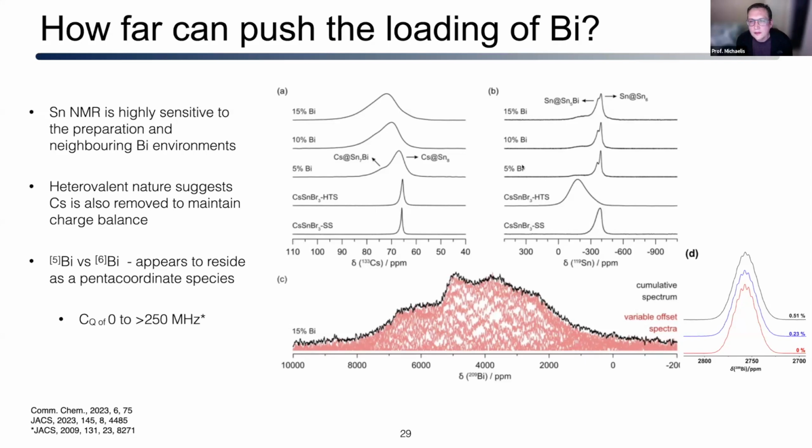Even though you do not see an EPR signal of the sample, you do see a slight shift as compared to the solvent synthesis. Can it be due to differences in the background hole density? Also, was the methyl tin iodide NMR rotor that showed fast degradation closed in nitrogen? Okay, I'm going to answer the second question first because the other question is a little challenging to address.